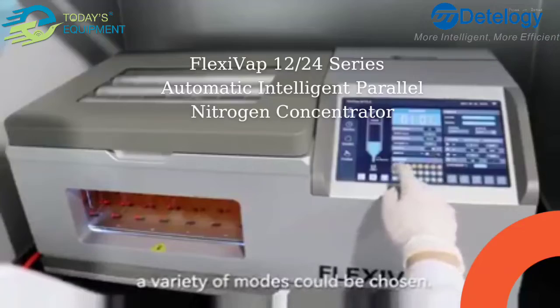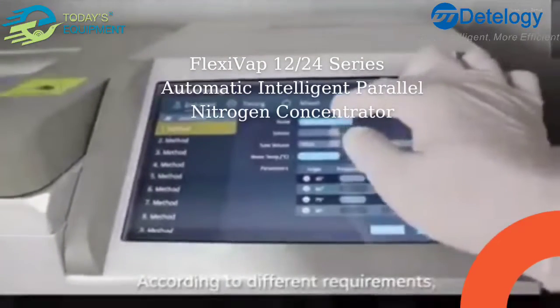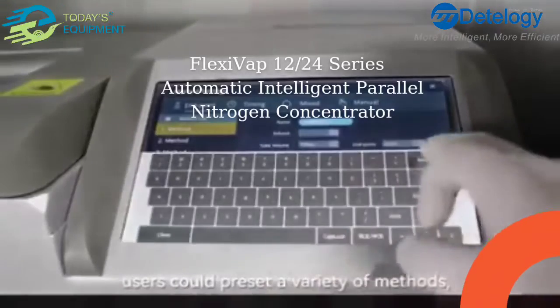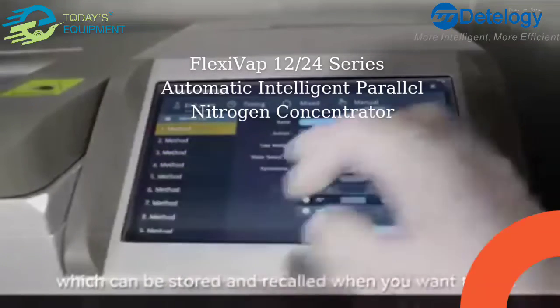A variety of modes can be chosen. According to different requirements, users can preset a variety of methods, which can be stored and recalled when needed.